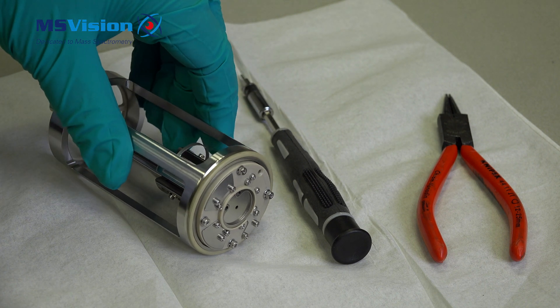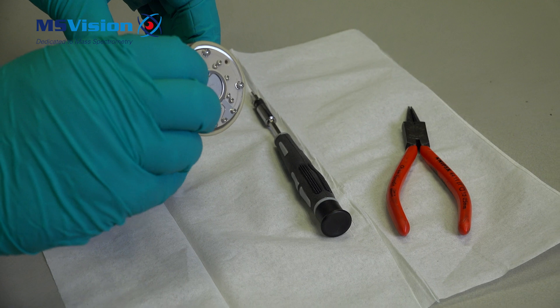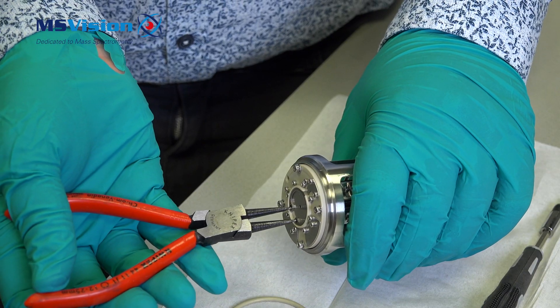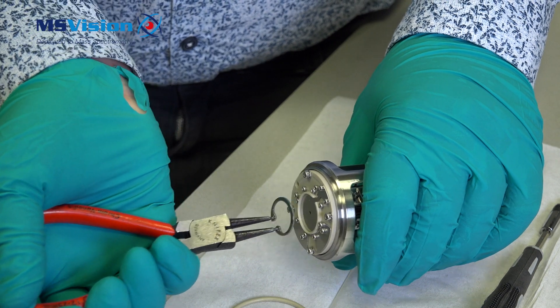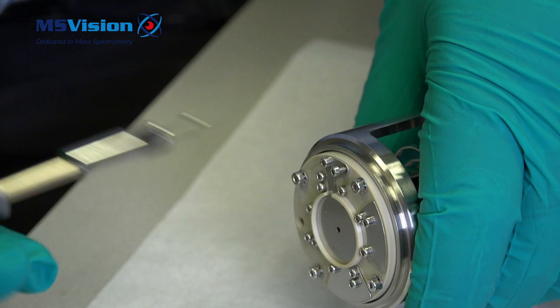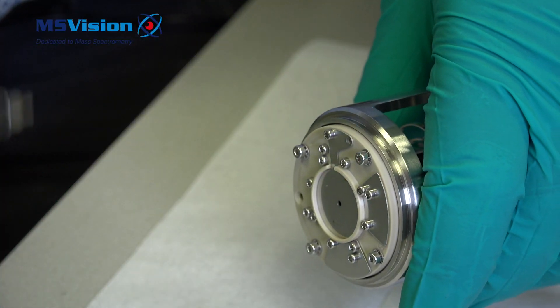To clean the Q-Jet, first remove the O-ring. Then using the circlip pliers, remove the circlip holding the lens in place, and then use an Allen key to remove the two small hex bolts. Remove the lens.